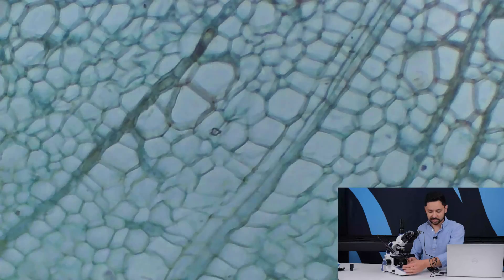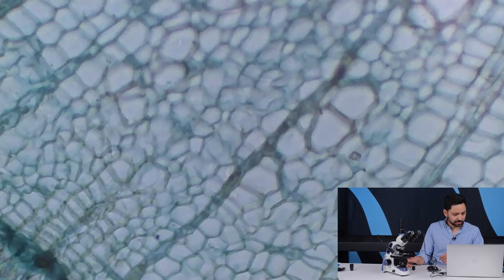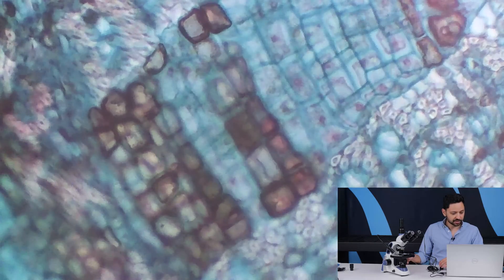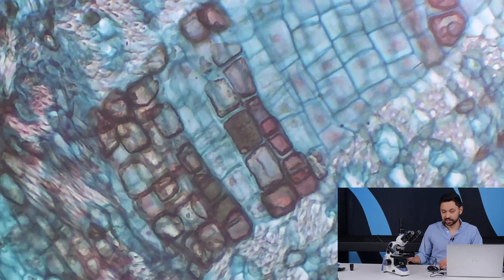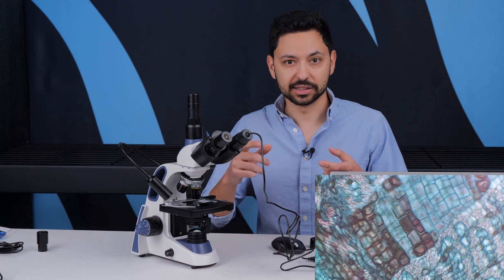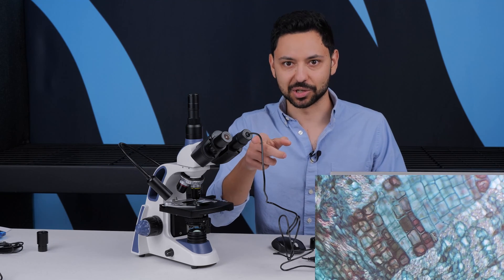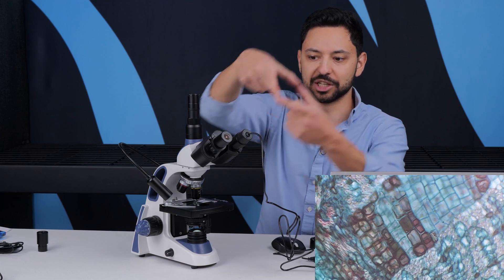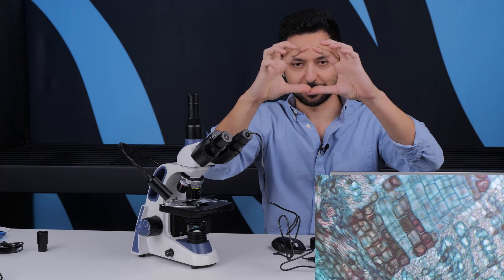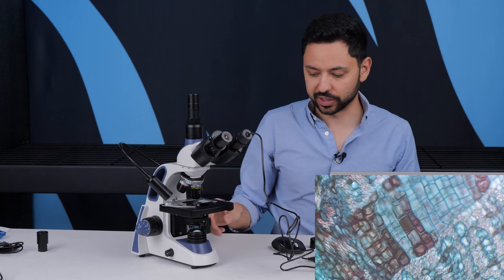The color accuracy on this one is not quite ideal — not horrible, but looking through even my phone this is getting a little better. You also notice this looks a lot more magnified than when I was using my phone, and that's because of something called crop factor. There's an actual physical size to the image sensor, so if you imagine the image coming out of your eyepiece is this big but the camera sensor is half that size, it's going to look double as magnified.